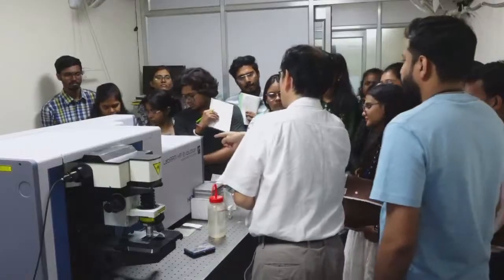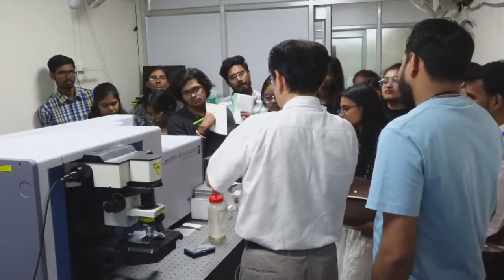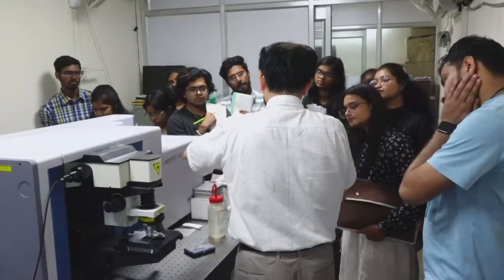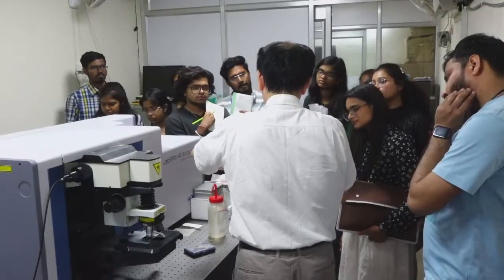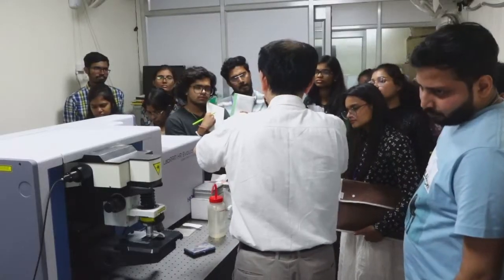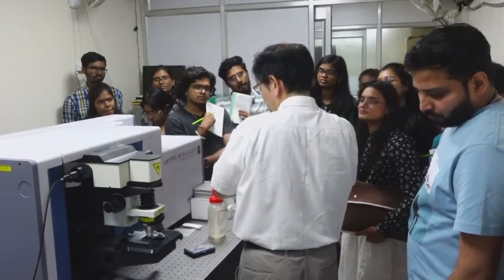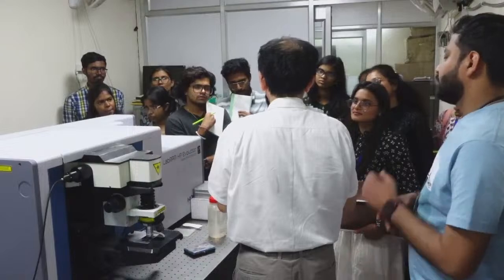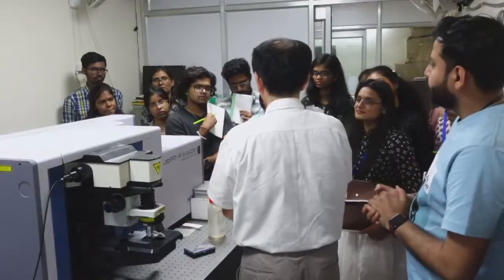And the laser output power is constant. If we focus the laser power to this size, the density is a certain value. If we focus on a smaller area, the density becomes larger, and with even smaller, the density is much larger. Then I0 becomes much larger. Accordingly, I Raman gets larger. So if we want to get a strong signal, a smaller focal point is more advantageous. But at the same time, it easily damages the sample.